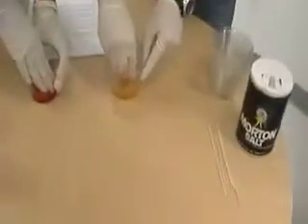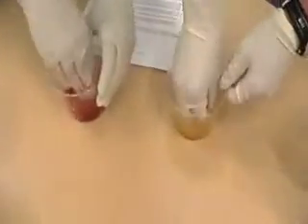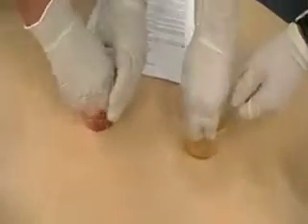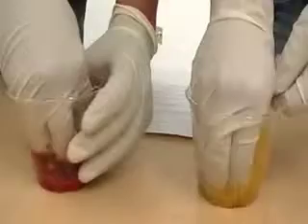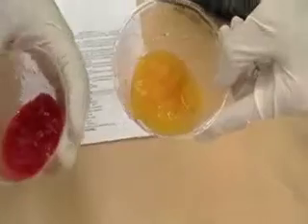break open the cell by a smashing process, physically smashing the fruit with your fingers. And we're going to demonstrate how to do that. So kids might really like to smush the fruit up, and it can be a little messy, so you might want to have paper towels on hand, but it doesn't have to be a complete liquid. Small chunks will be okay. So after a couple of minutes of smushing, the strawberries look about this, and peaches look good, so we're ready to move on.